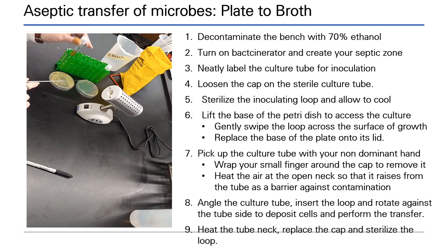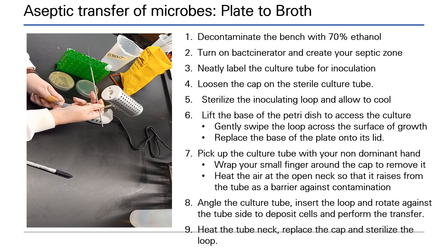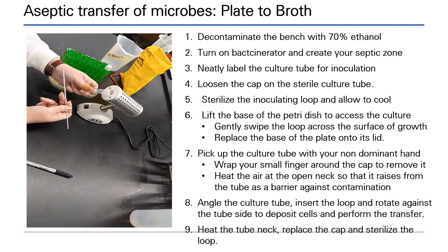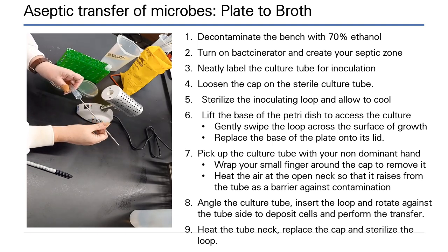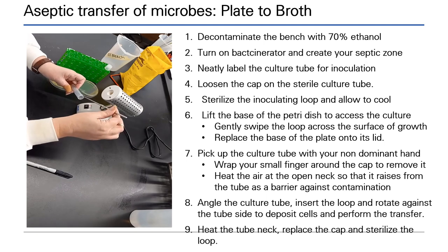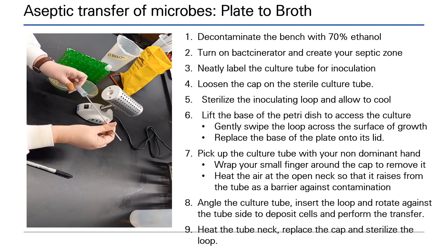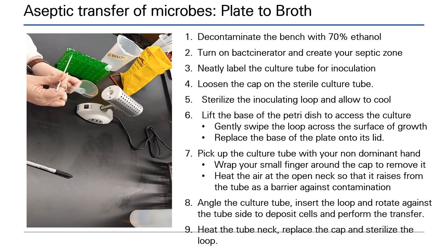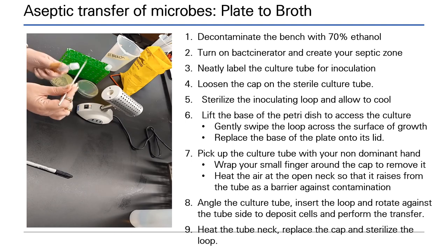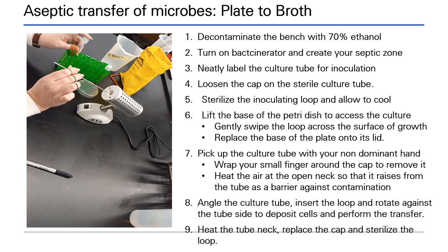Pick up the culture tube and carefully wrap your finger around the cap to remove it. Next, rotate the mouth of the tube in the vaccinerator to heat the air — this will help create a barrier to contamination. Insert the loop and rotate it against the side of the tube to transfer the cells in. Remove the loop and heat the air at the neck of the tube again before replacing the cap. Remember, the loop is still contaminated and must be sterilized.